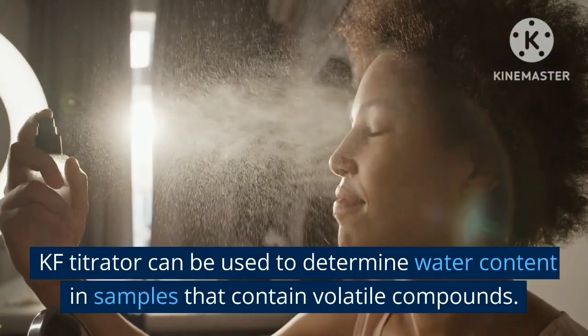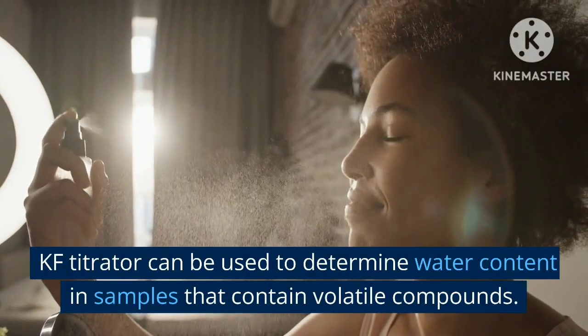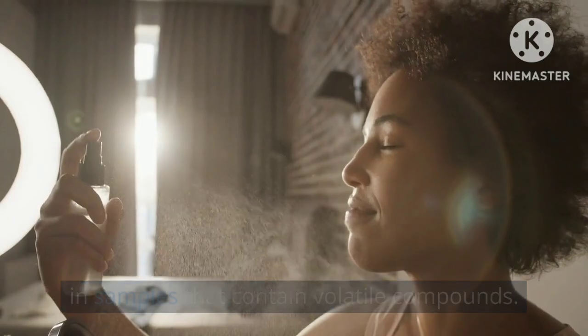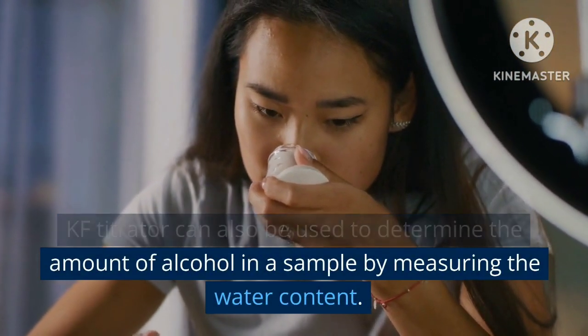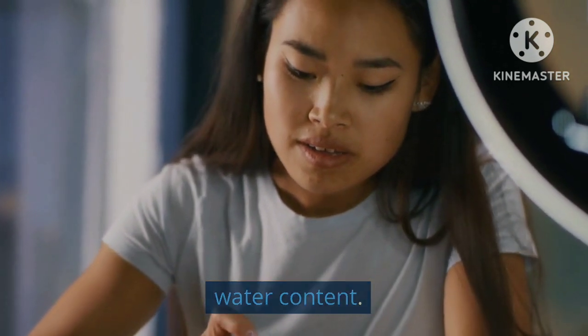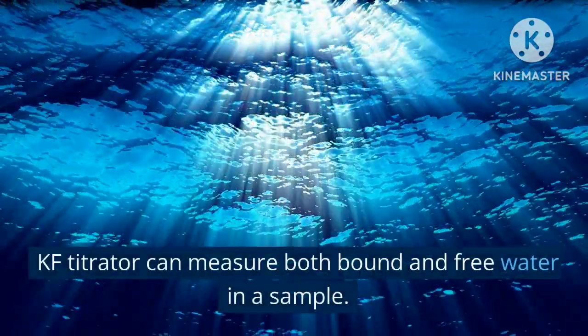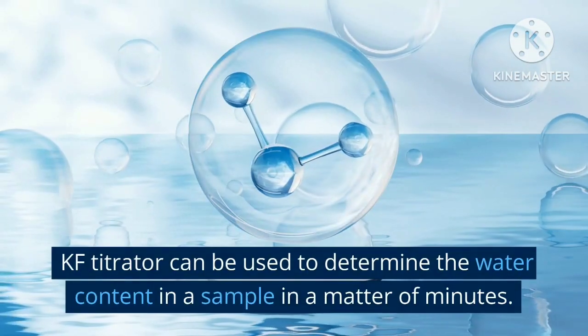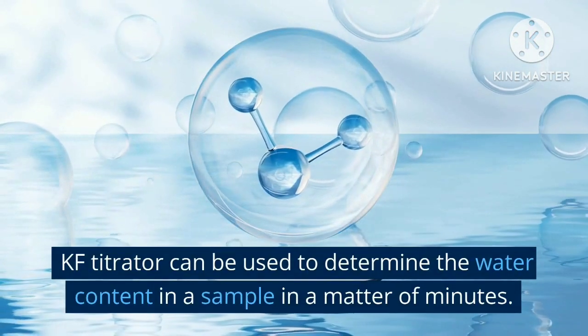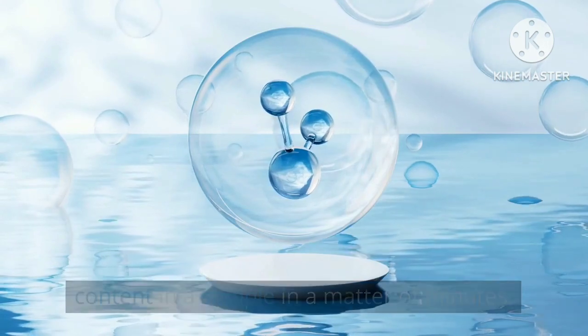KF titrator can be used to determine water content in samples that contain volatile compounds. KF titrator can also be used to determine the amount of alcohol in a sample by measuring the water content. KF titrator can measure both bound and free water in a sample. KF titrator can be used to determine the water content in a sample in a matter of minutes.